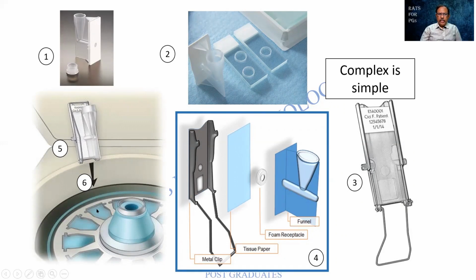One word is, it has to be balanced. Once I put a material over here, exactly a similar volume should be kept on the opposite side. Otherwise, there will be an imbalance and the centrifuge will be dangling.